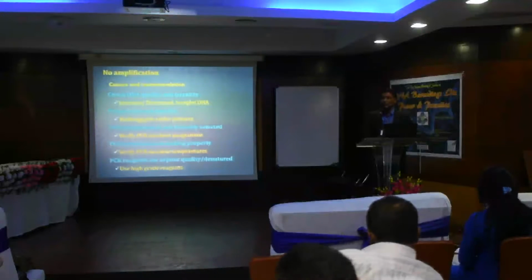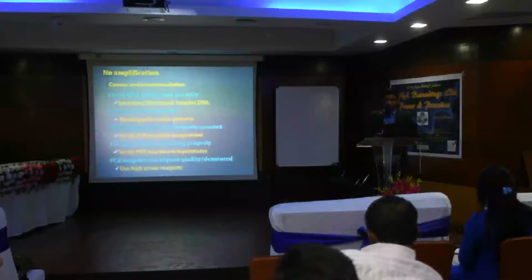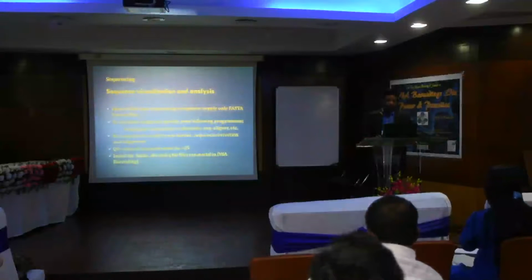Products. In my laboratory, I am not advocating, but I usually use Invitrogen, Takara, and then Taq polymerase. Some of these are good quality things you can use, but affordability also depends on everyone, on whether you have that supplier there or not. But make a good decision to have good machines and good reagents also.